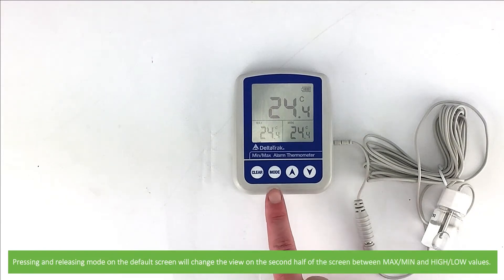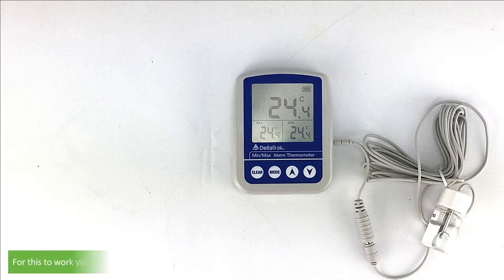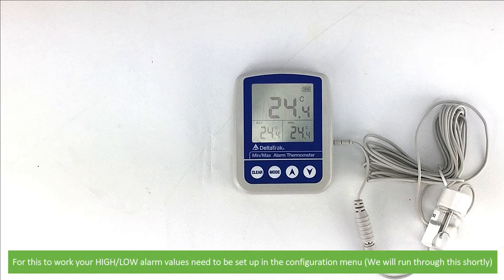Pressing and releasing Mode on the default screen will change the view on the second half of the screen between max, min, or high/low values. For this to work, your high/low alarm values will need to be set up in the configuration menu. We'll run through how to do this shortly.